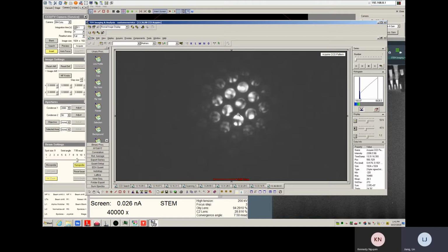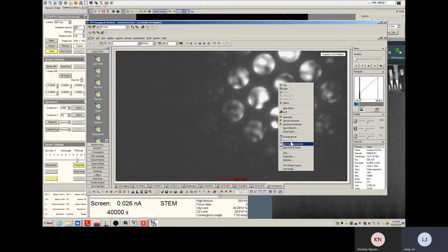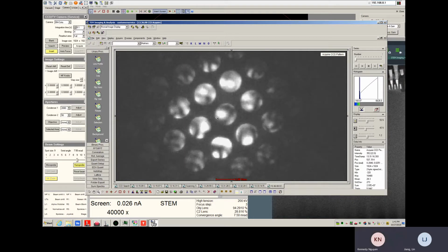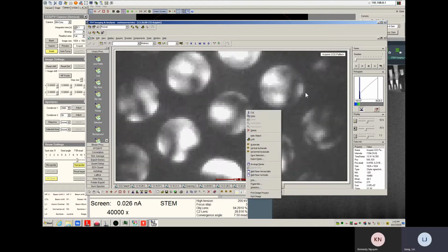Some people use them for determining the strain they have within the grain, or even special defects. Also, some people take a look at the polarization. So this is for different applications. If you want to see something within the disk, the goal is to see something within the disk. It's not about something outside, not just about the orientation. It gets more information within the disk. Okay.